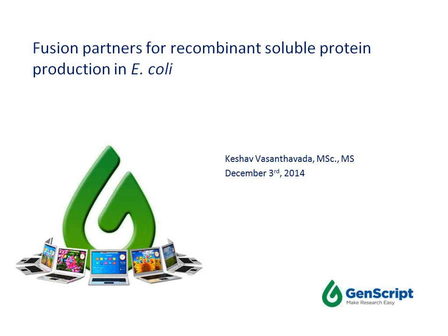And so in line with my background, the topic of my talk today is fusion partners for recombinant soluble protein production in E. coli. So as scientists in the life sciences area, we all realize at some level the importance of recombinant soluble proteins in discovery research, right? So as you know, E. coli is a popular choice for the production of these proteins.